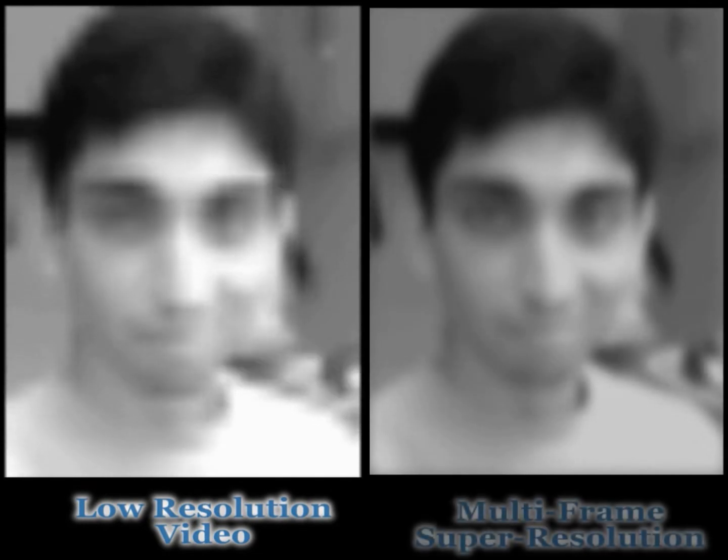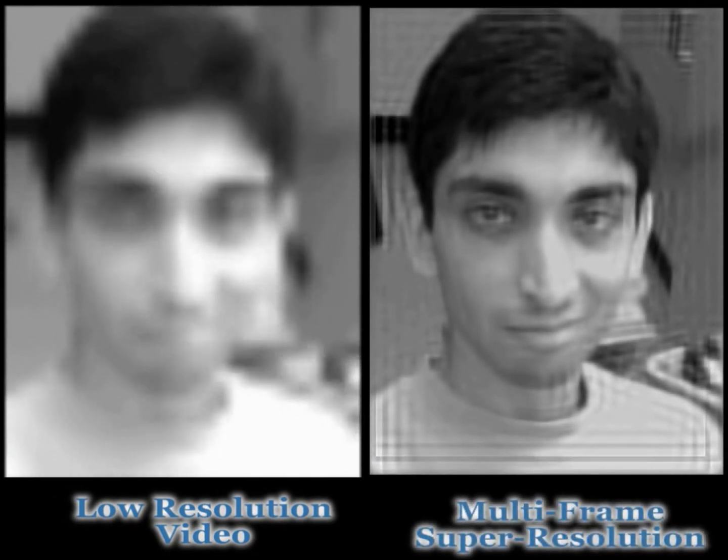Pixel super resolution is a digital processing algorithm which allows using multiple low resolution images, like video frames from a surveillance camera, to create a single high resolution image like the one you see on the right here.